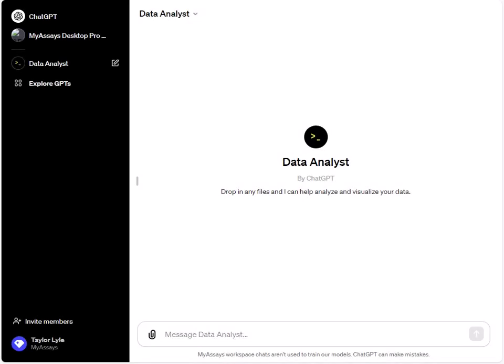In this video, I'll provide a review of using ChatGPT to analyze ELISA data. Artificial intelligence is an incredible tool for performing a variety of different tasks and could be used to complete ELISA data analysis.